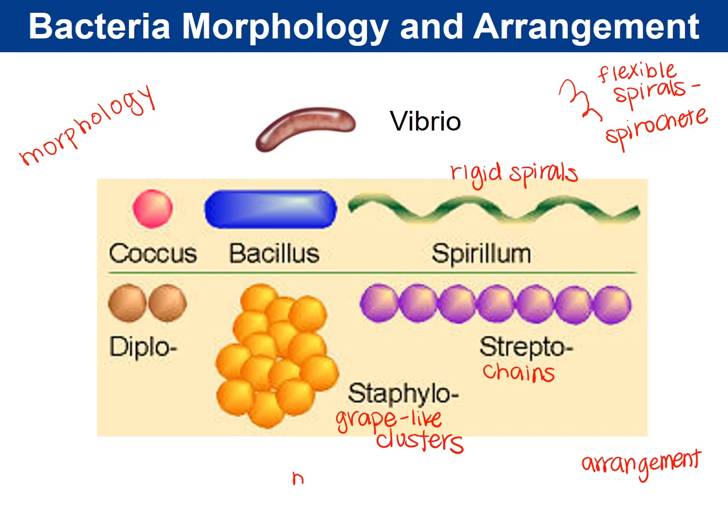So no Staphylobacillus. And that has to do with the way that the bacteria divide. In bacillus, they're going to divide along the short end, meaning that they're going to form chains. They don't divide vertically. And so you're not going to find Staphylobacillus. You can find Streptobacillus, but not Staphylobacillus.